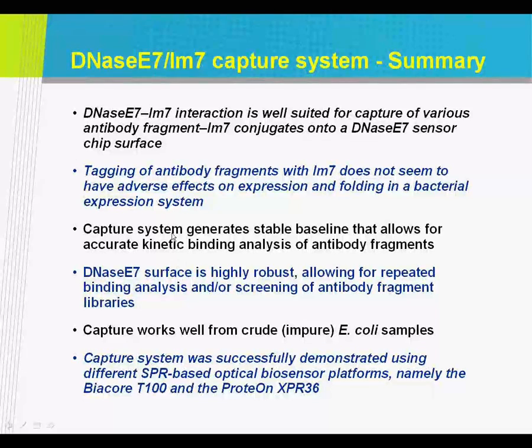Okay, I have finished the main part of the talk, and I just have about 4 slides addressing some of the issues that one can see with parallel biosensors, and in this particular case, my experience with the ProteOn. And it relates to capture of your ligand onto the chip surface.